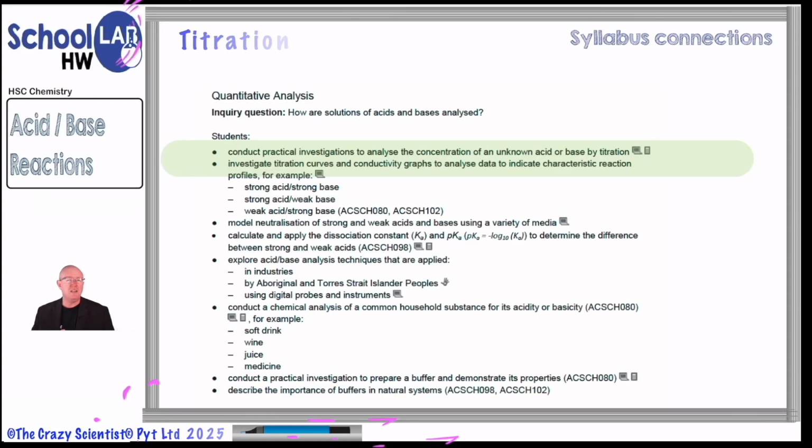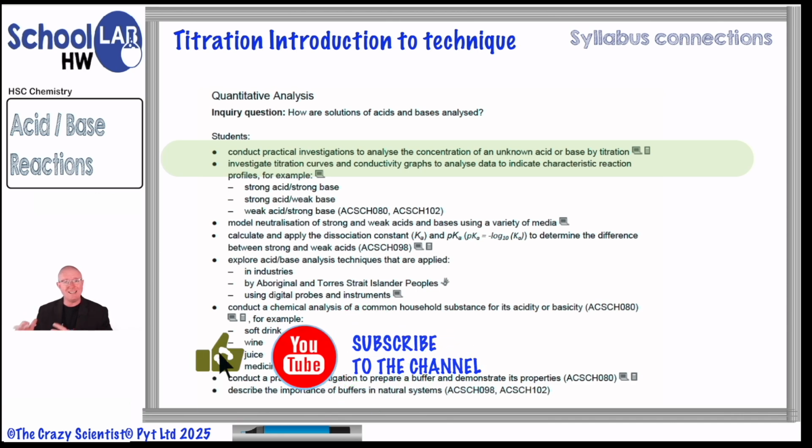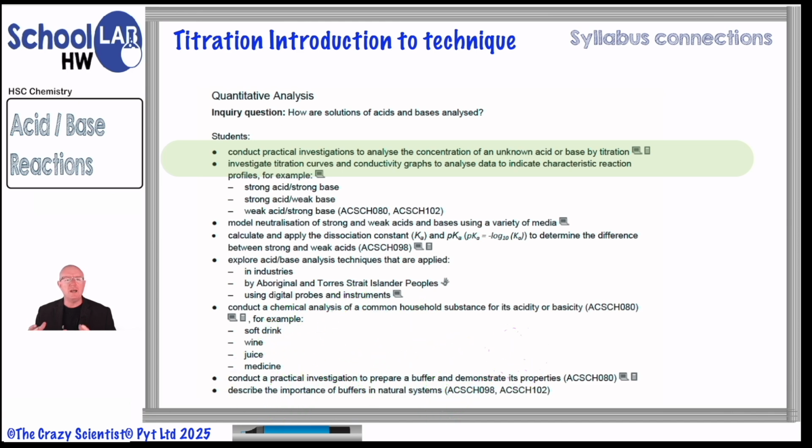We're into another video here in getting a feel for what titration is. We saw from the last video that acid-base titrations are the main one we're going to be looking at in this series of videos. So let's get a feel for how we conduct an acid-base titration.